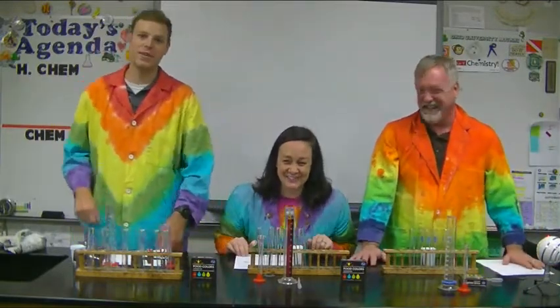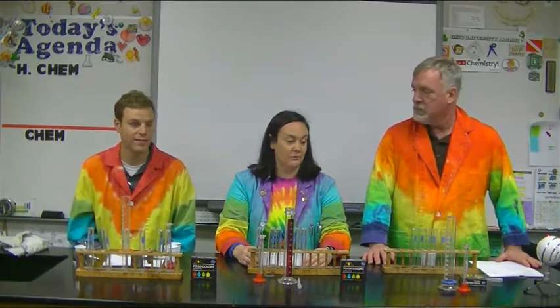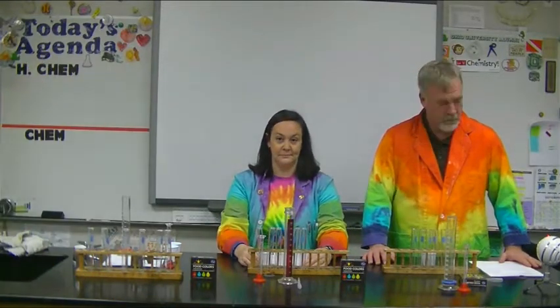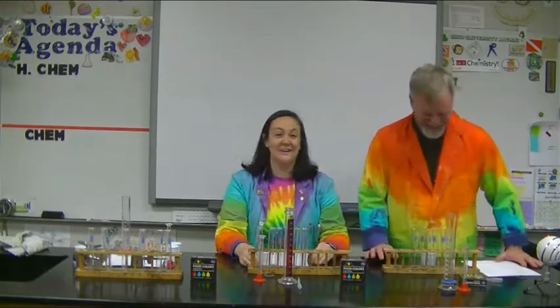Game time, baby. Fill each plastic cup with 50 milliliters of tap water. Oh, we forgot. Pilcher, will you go get us some tap water? Oh, yeah, I'll get some beakers. Thank you. Such a good lab assistant.